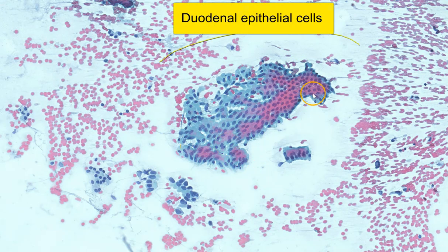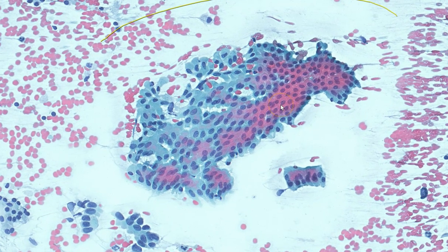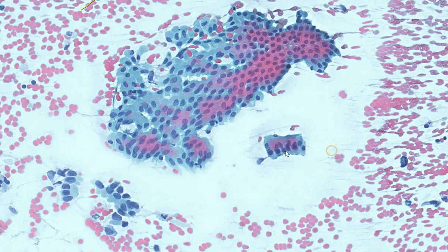Here is a honeycomb sheet of duodenal epithelial cells, and we often see these cells in head of pancreas lesions where the needle traverses the transduodenal route. Again, strikingly uniform and honeycomb in arrangement, and the nuclei are very uniform in size. We can even see that the polarity of the nuclei is maintained in this strip of columnar cells.